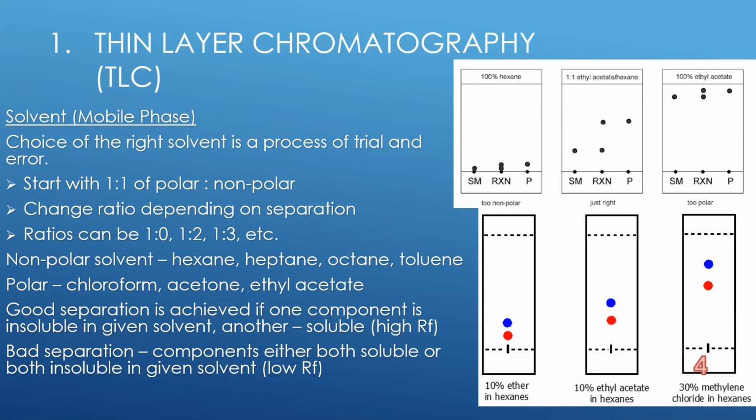So those retardation factor values can range from 0 to 1, with 0 indicating that the solvent polarity is very low and 1 indicating that the solvent polarity is very high. So as you can see, hexane is very low, so its retardation factor will be close to 0, and for example ethyl acetate has a very high, so it's almost 100%, very high retardation factor. What the retardation factor is, we'll see later.